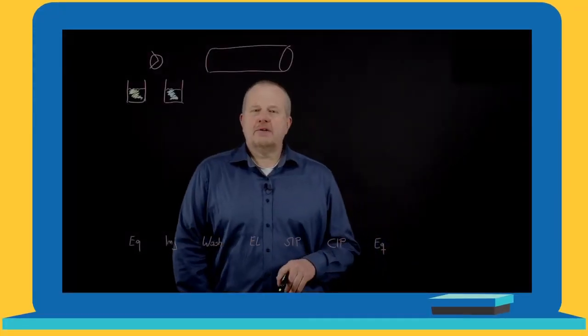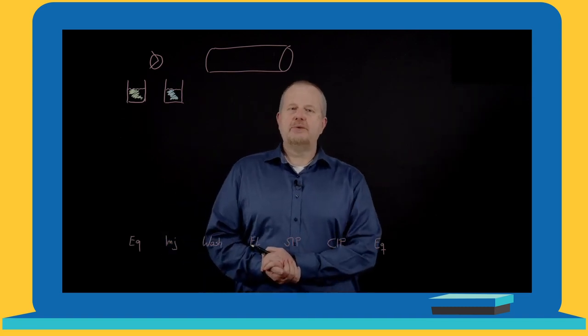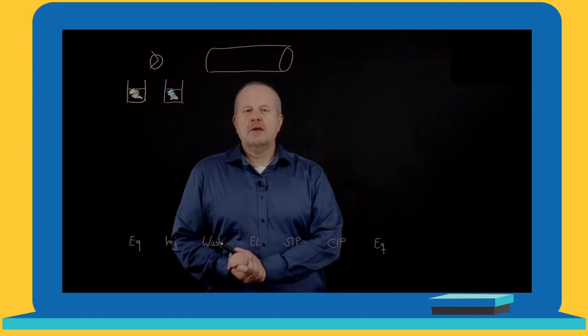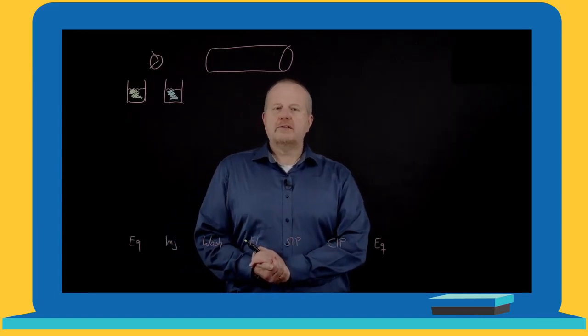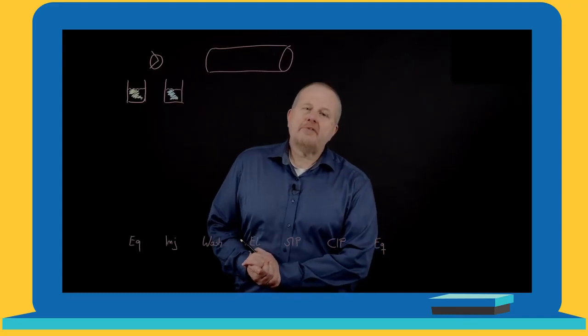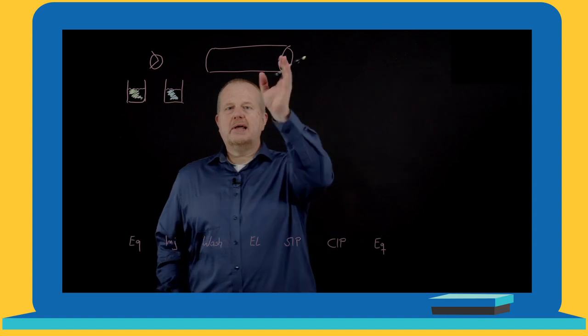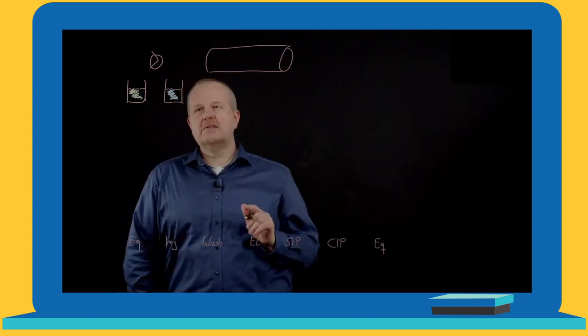So in the third part of our video, we come now to a real preparative separation, and we will set up something which you will use as the preparative separation of a compound of interest. Everything we have done so far was a quite easy system. So we had a column, and you know now what's in this column.